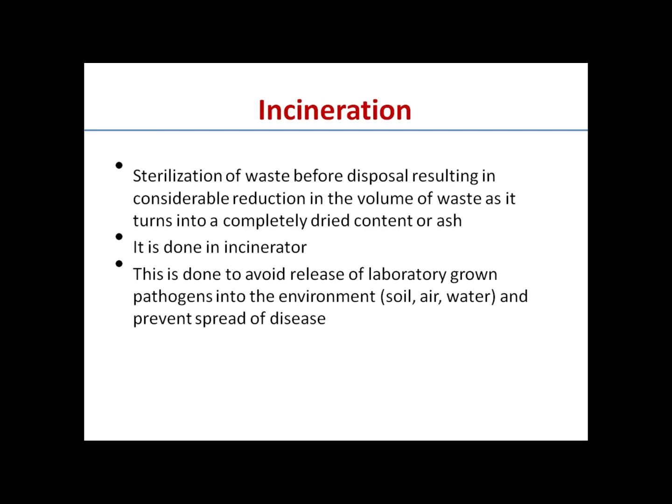It is done in an incinerator. Mainly, incineration is done to avoid release of laboratory grown pathogens into the environment like soil, water, air, and prevent spread of disease. In the plant pathology lab as well, we should strictly follow this incineration.